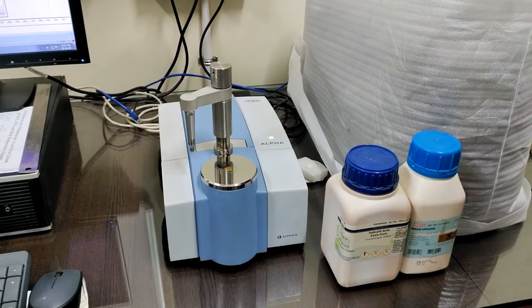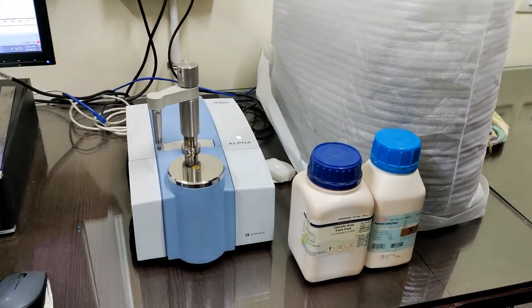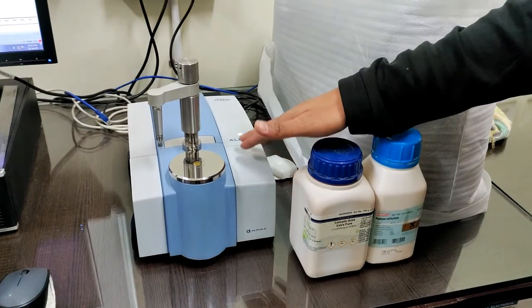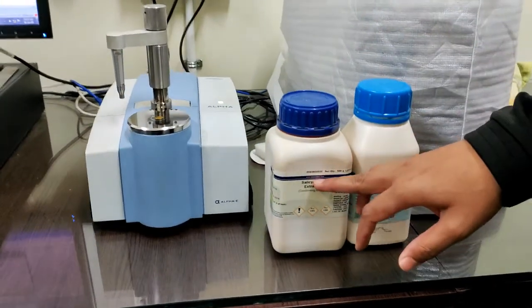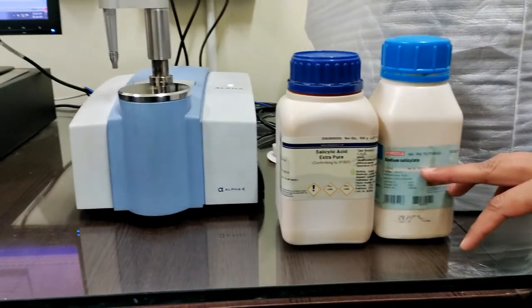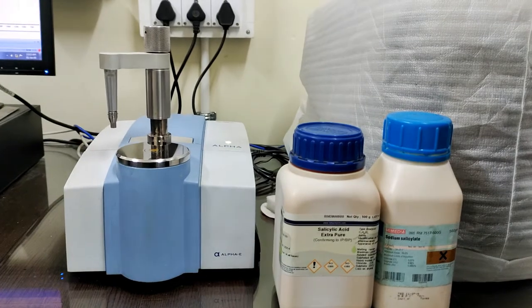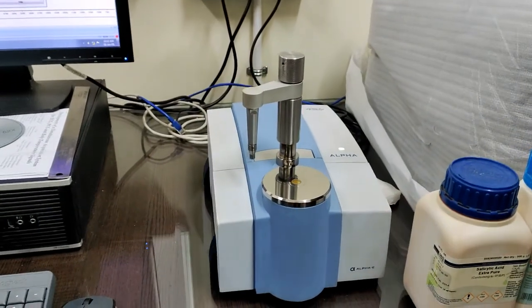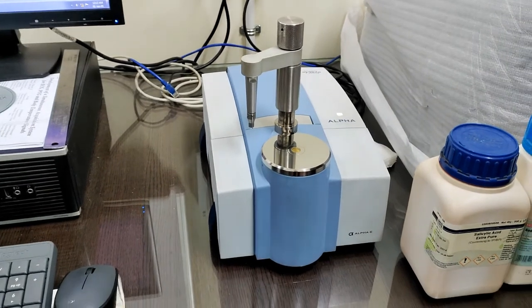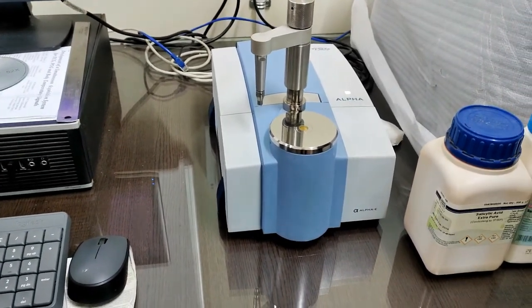As you have already seen how to take the FTIR data with this machine, now what we will do is take two samples, one is salicylic acid and one is sodium salicylate, and we will perform the FTIR analysis. The work for you guys is that I will provide you the FTIR data, and you have to analyze the data.